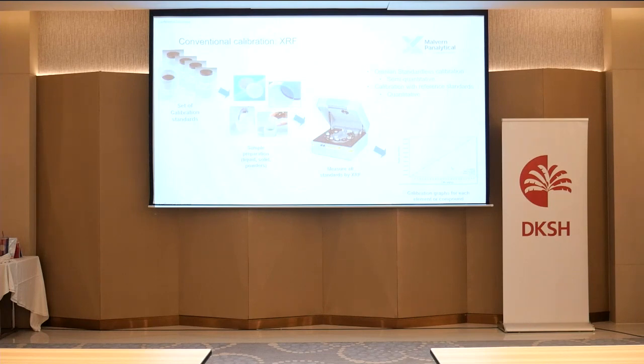Usually XRFs require some kind of calibration. The calibration can be standardless calibration. We call it standardless because we provide some generic samples, and you calibrate the XRF with that. We call that the Omnian calibration. Then we apply all the theoretical corrections to correct for your matrix effects and everything to give you as good data as possible.